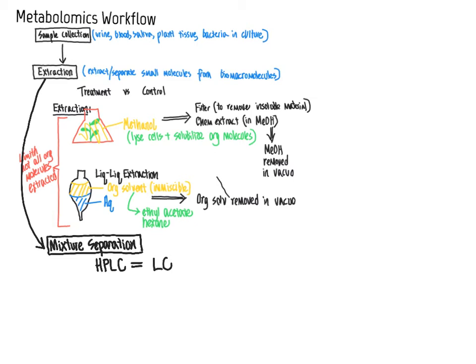Another technique that is used to separate mixtures is, rather than liquid chromatography, gas chromatography, which I will write out, that gas chromatography stands for GC since we haven't talked about that before.